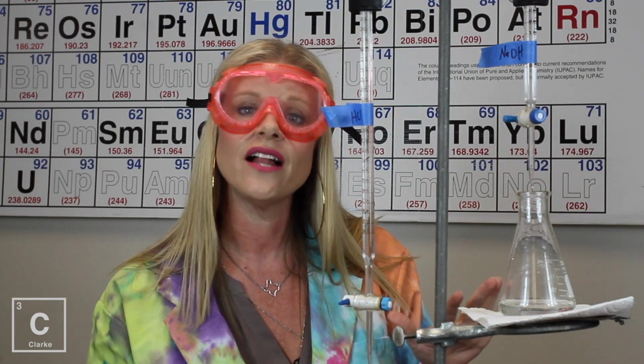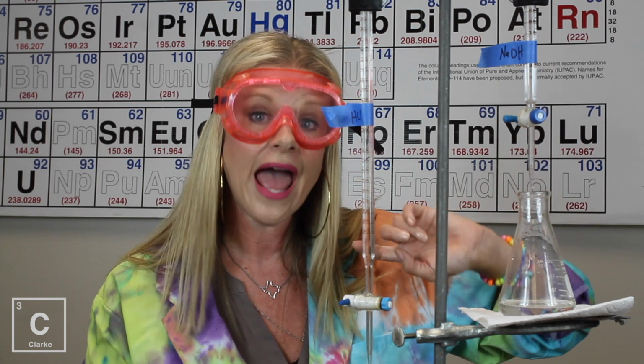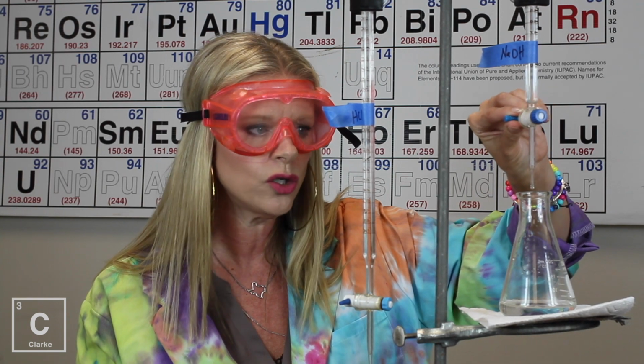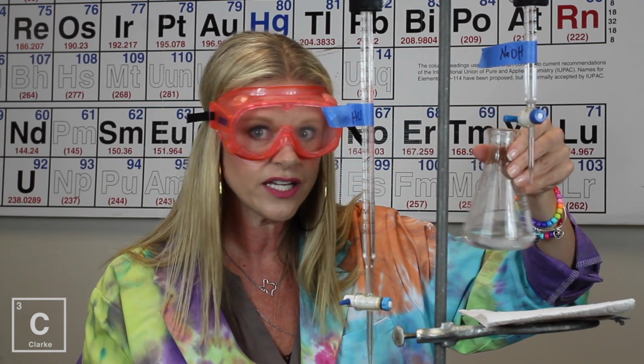Now I put this phenolphthalein in here because it's going to tell us the moment that the hydroxide ions overtake the hydrogen ions, when we have more base than acid. I'm wanting to get right to that point. So I'm going to add some base little by little. That pink kind of scared me a little bit, but when I swirl it, it goes away.